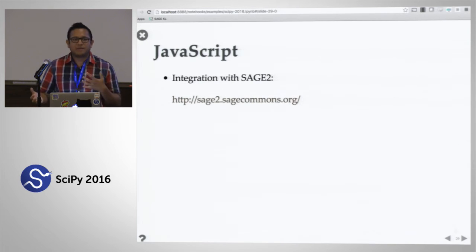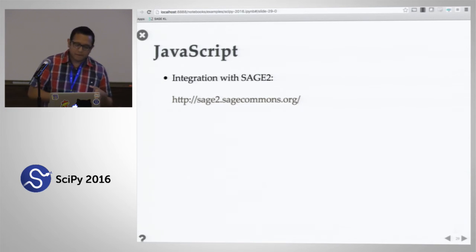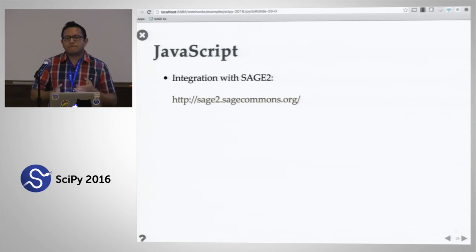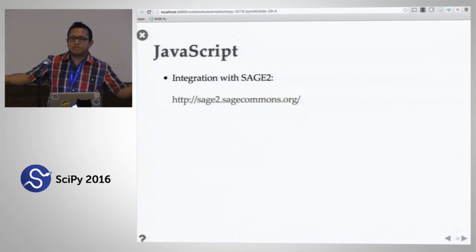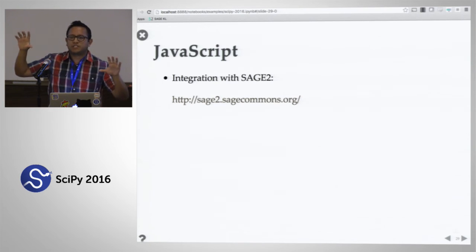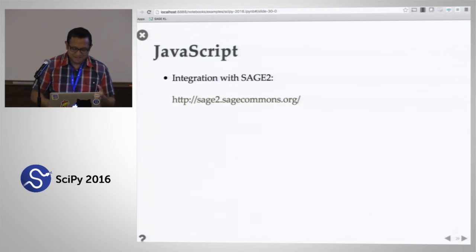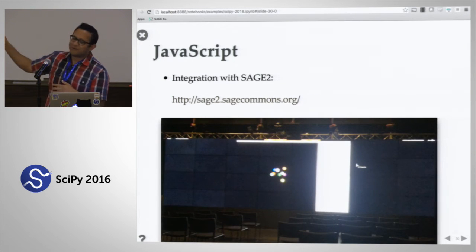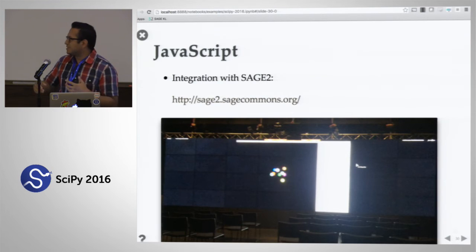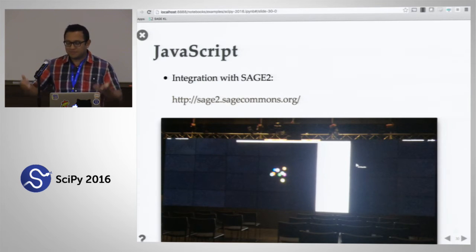One of the nice things made possible by this API was integration with SAGE2. SAGE2 is a platform for displaying information on multi-tile displays — those huge video walls with 20 or 30 full HD displays arranged as tiles. That is Emperor running in a SAGE2 platform back at UCSD on a 32-tile display. It just works because it's JavaScript and SAGE2 is written in JavaScript.